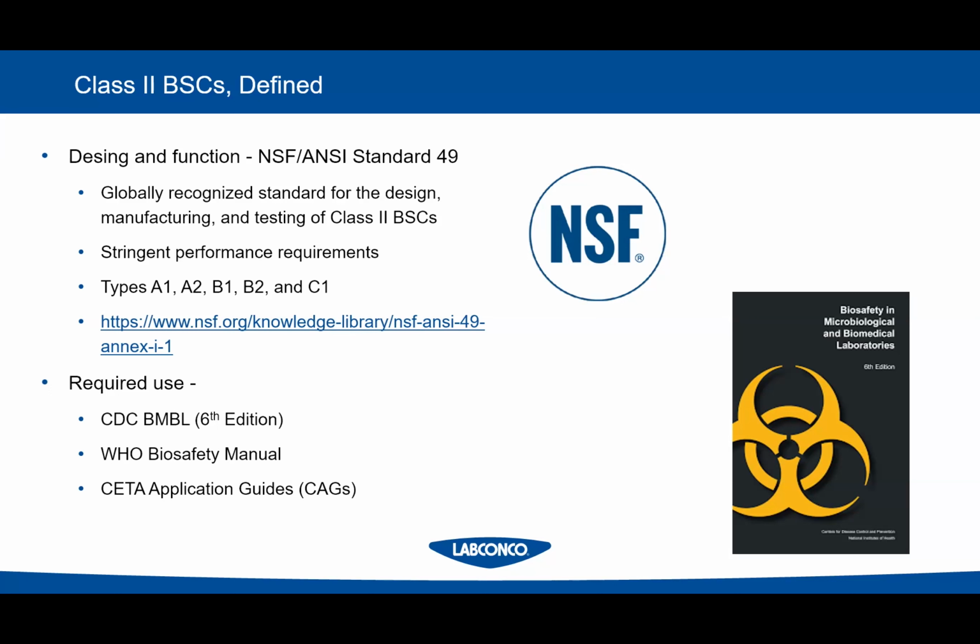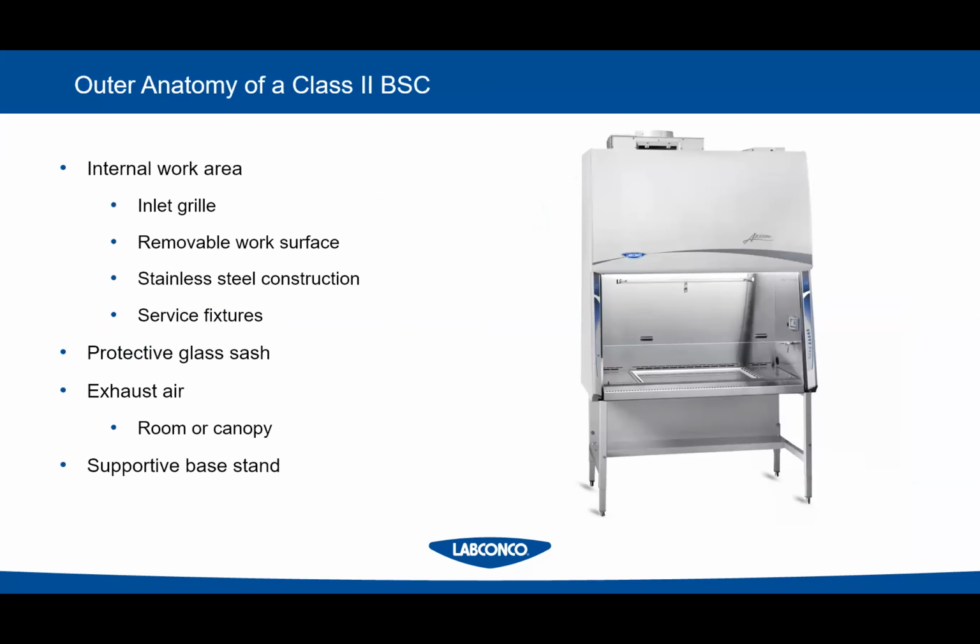How do we know when we need to use them? Again, this BMBL book will tell you class 1, class 2, class A2, class B2, all of that kind of stuff when they need to be used. This is what they typically look like.